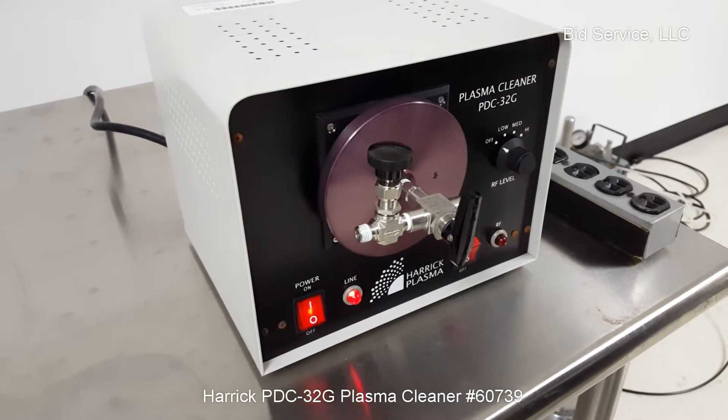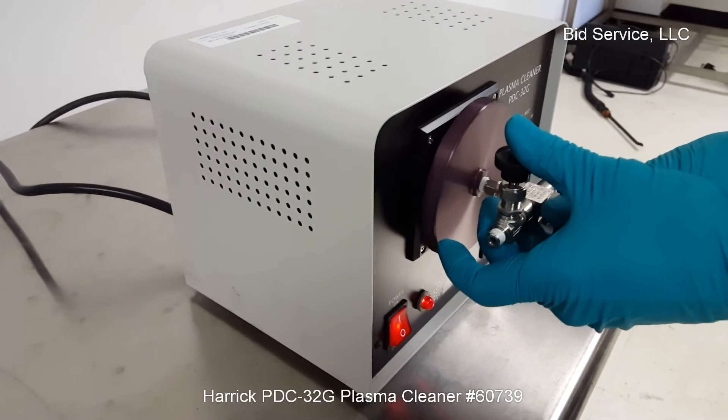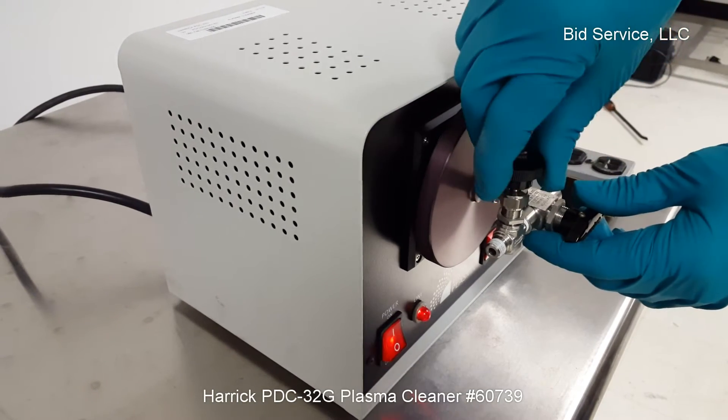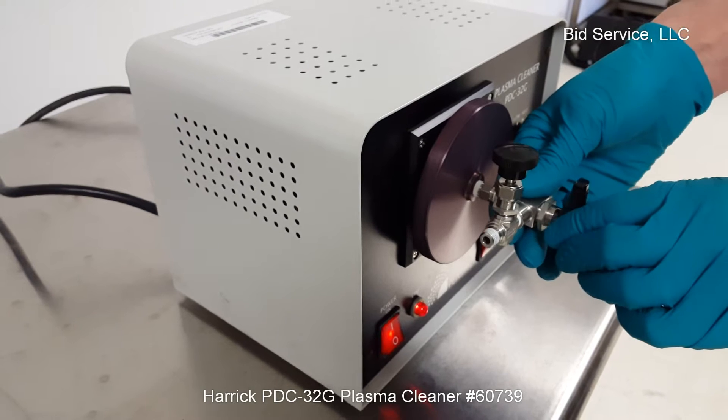I'll let this pump for a little while. This direction here would be vent — you can hear it pulling air in through here. I'll explain that later. This direction here you can adjust your gas flow in. I'll just leave this closed for now.